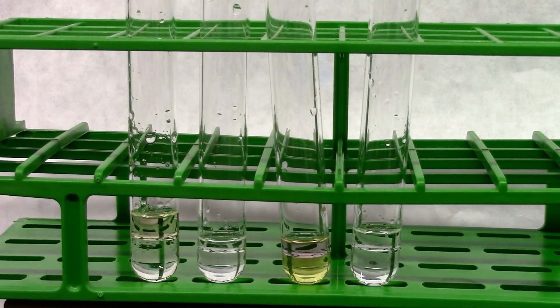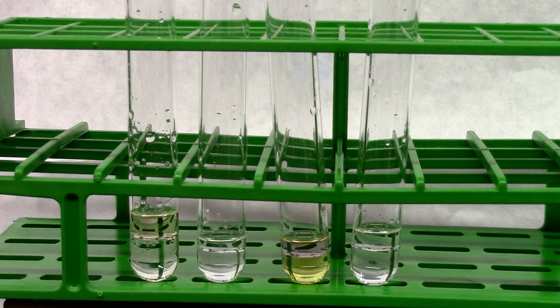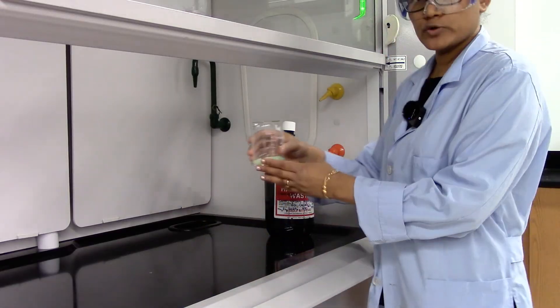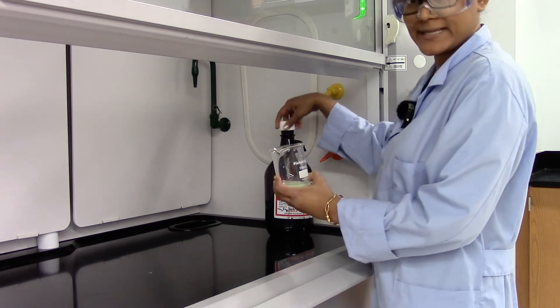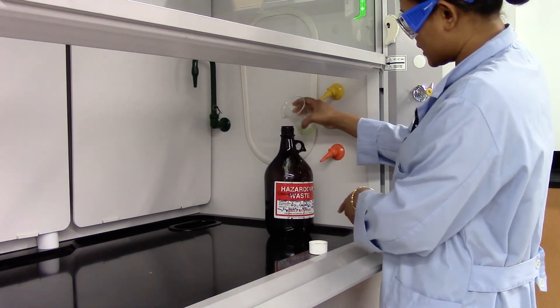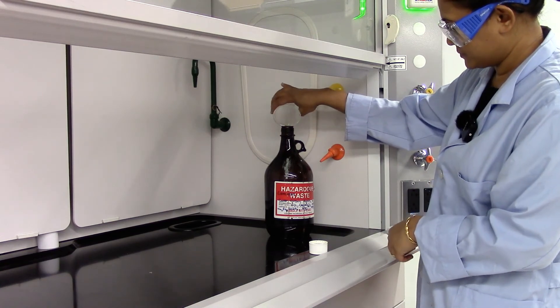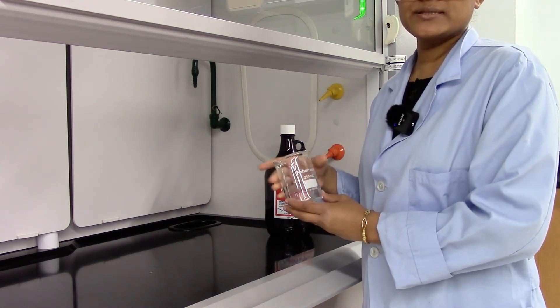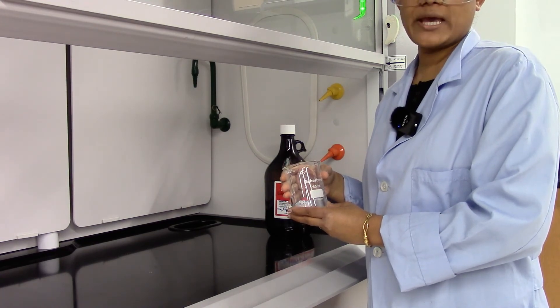We'll clean the test tubes and put the metal solution in a labeled waste bottle. I'm going to dispose all my metal solution collected in a waste bottle which should be labeled. Now you can rinse your beaker in the sink and put it back in your cabinet.